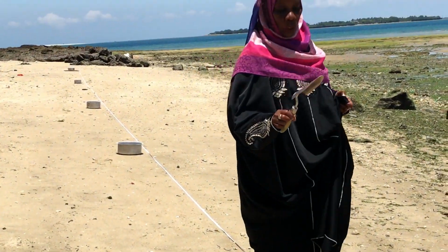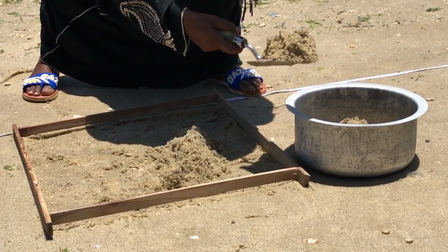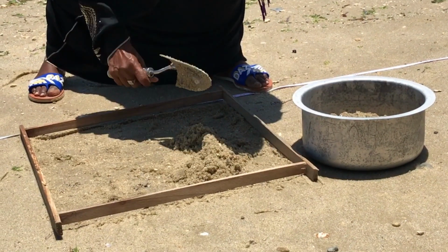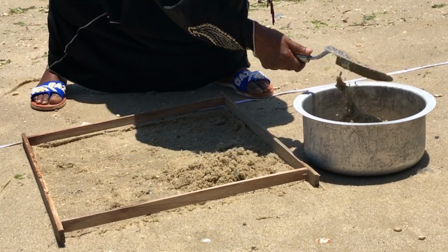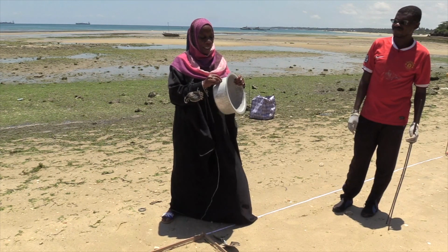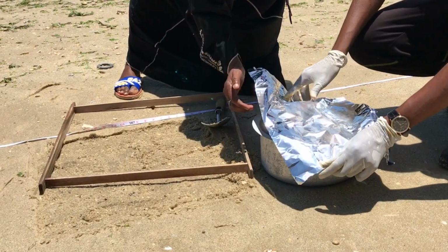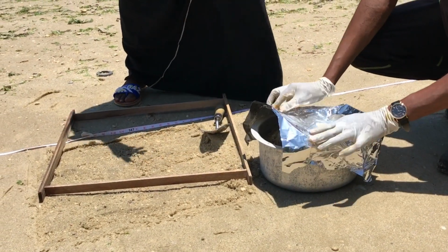So we use basins or metal pots, and we put each replicate in a different pot. After that, we measure those quadrants. For each pot, you should put the number, because we don't use 2 replicates in the same pot. To avoid contamination, you should label each replicate, and handle them using only metal materials. Then after that, we take them to the laboratory for the other analysis.